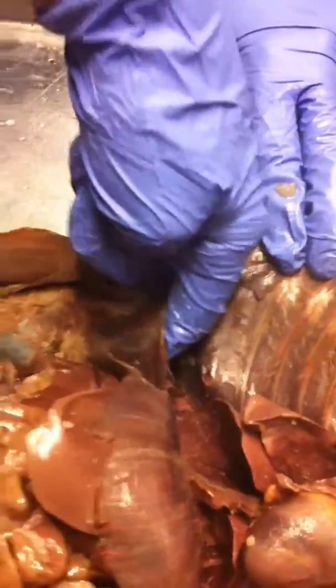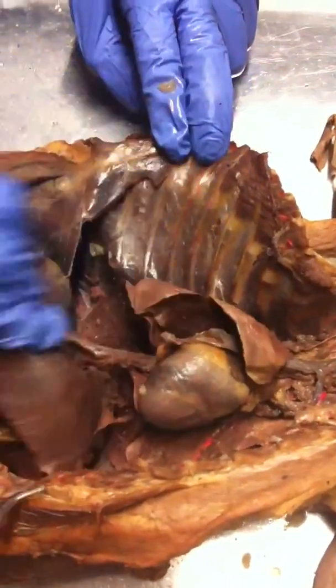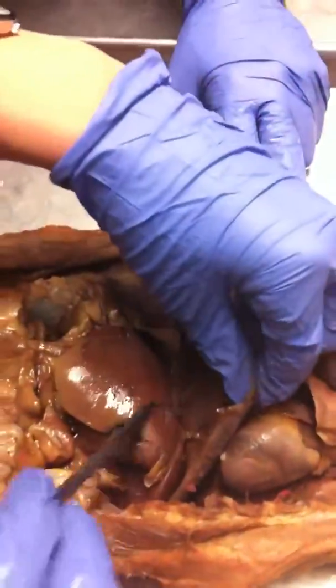Diaphragm is here. It hasn't been too dissected, and so it separates, oh, there it is. There, that's the diaphragm. It's right underneath the heart and the lungs, basically. And right above the liver.